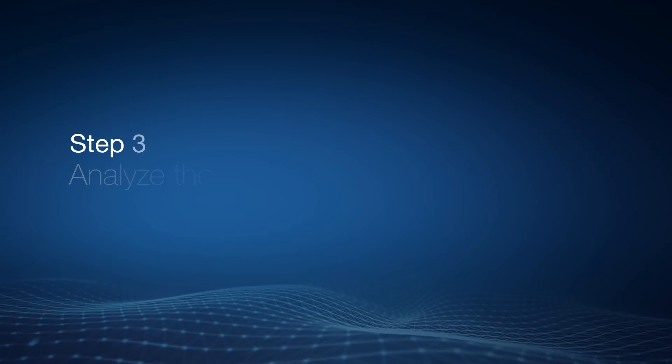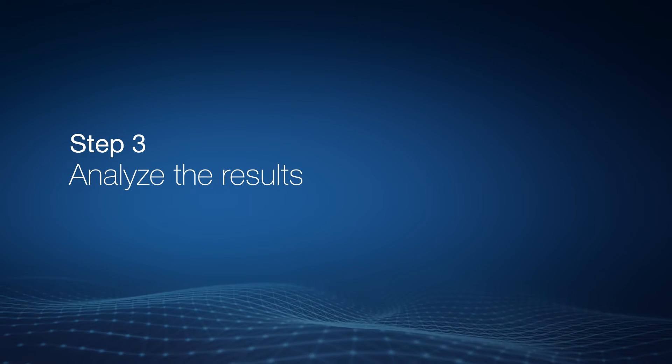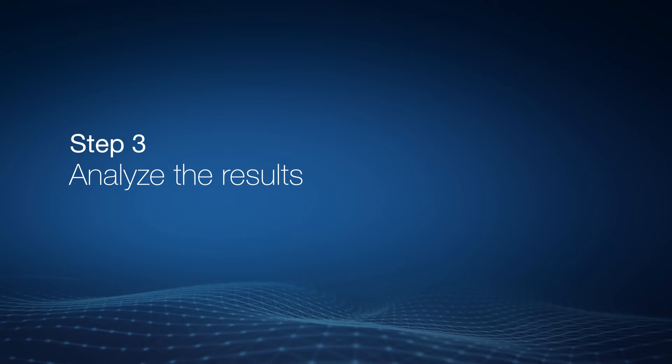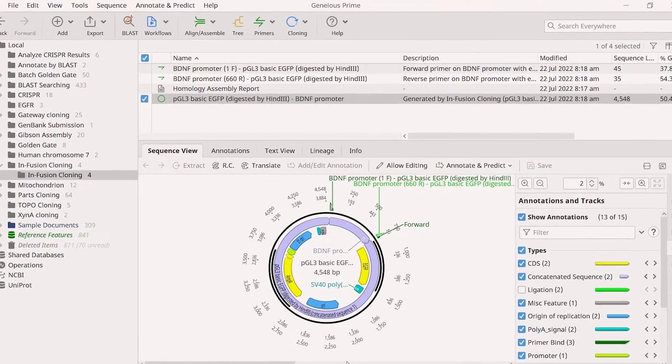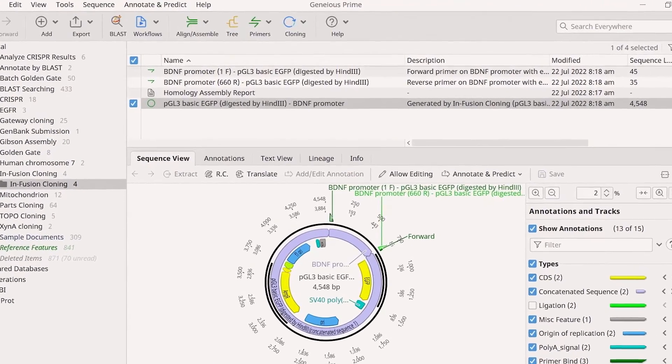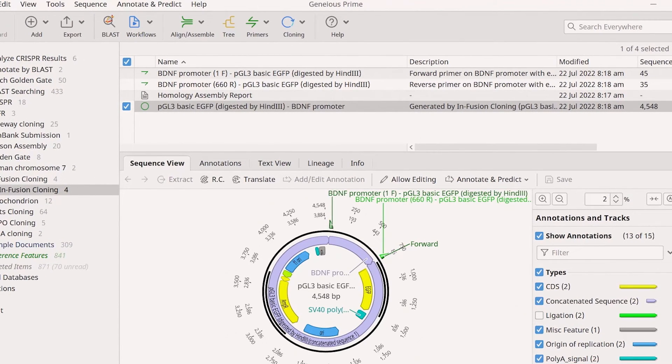The final step in the infusion cloning simulation is to analyse the results. After performing the simulation, you will see a series of new files in the document table.